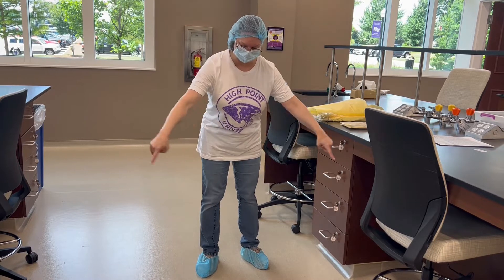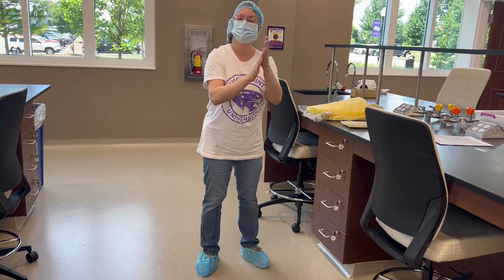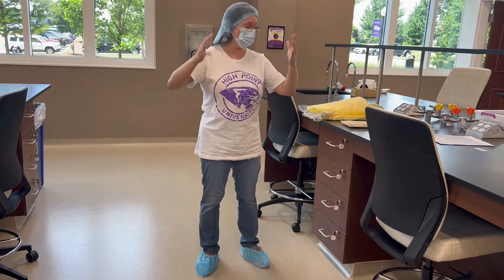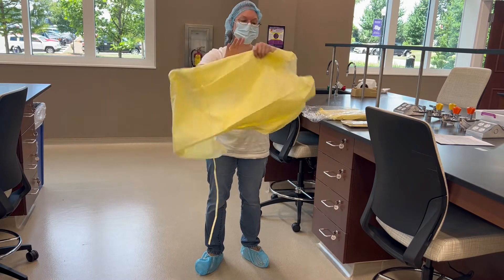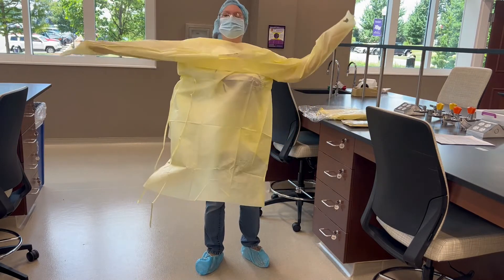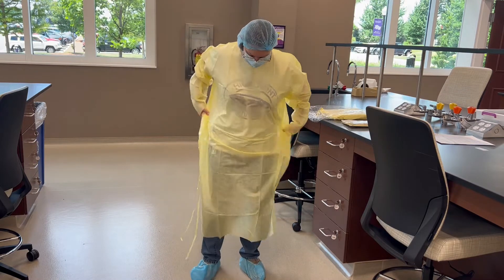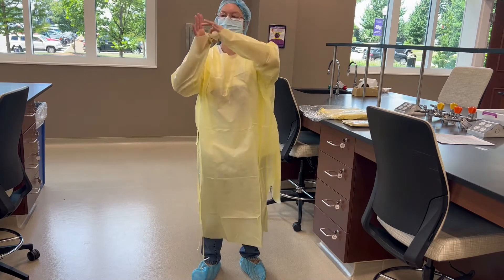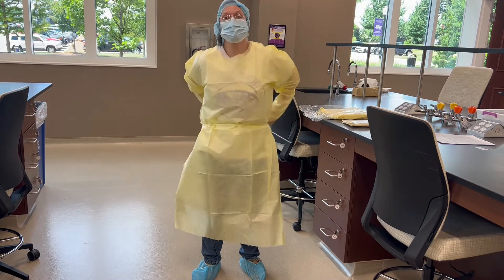I'm still on the clean side of the line of demarcation and our hands are clean. We had already applied some rubbing alcohol to our hands after we finished washing. Now while that dries, we're going to put the gown on. Make sure to tie the strings around your waist.